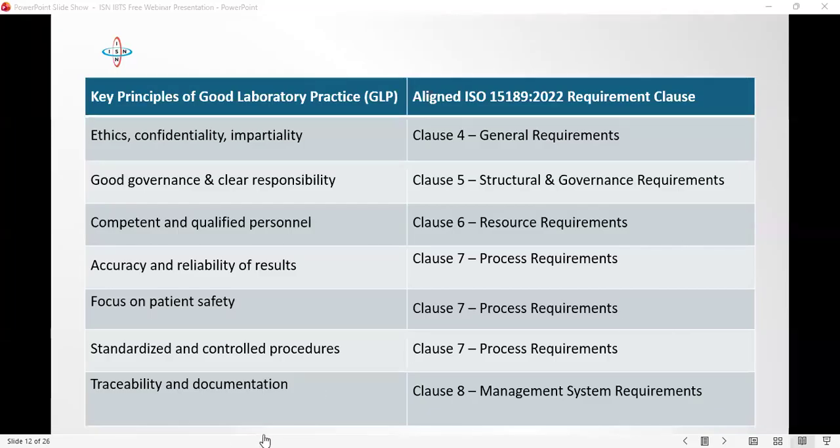Yes, I think it is mainly the people that are conducting the test that should be in charge of the quality of the procedure. So the quality officer should kind of oversee what the people conducting the test are doing. Do you understand? Yes, I do. So that's how I say it. Okay. So it is everybody's responsibility.